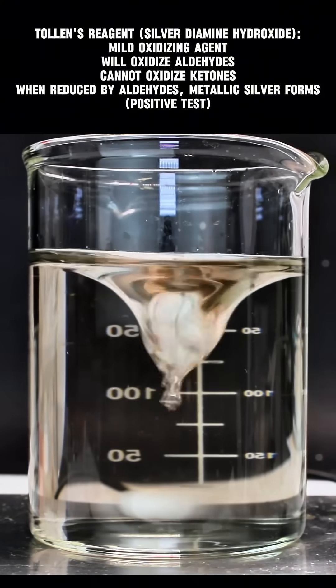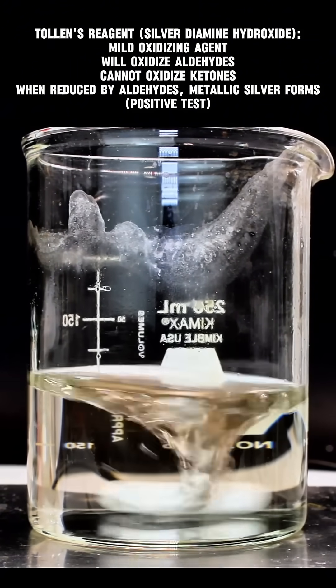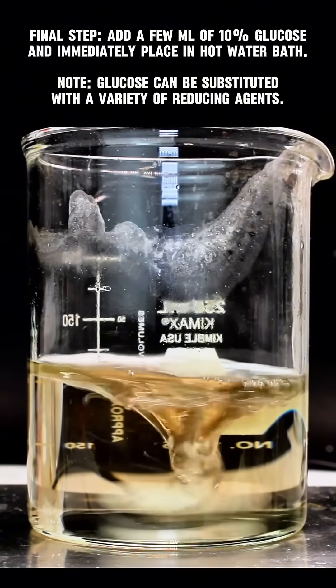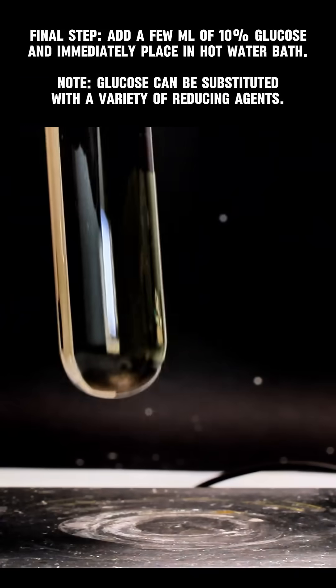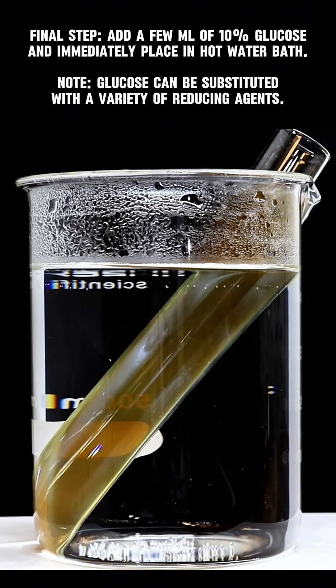The way this works is that Tollens reagent is a mild oxidizing agent that will selectively oxidize aldehydes. At the same time, silver ions are reduced to pure elemental silver, which forms as a perfect mirror finish. The selectivity for aldehydes makes this a useful analytical tool, but if you just want to make a silver mirror, you simply need to add some simple aldehyde like formaldehyde or glucose.